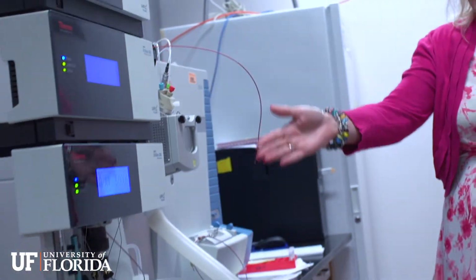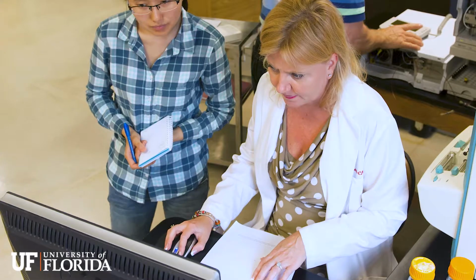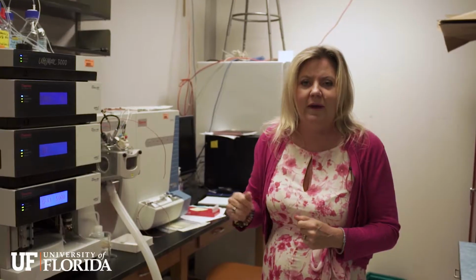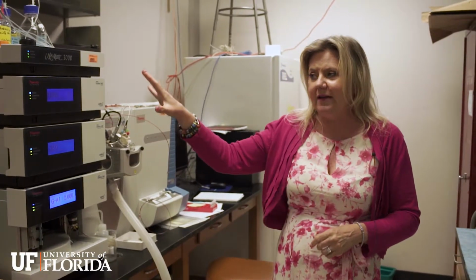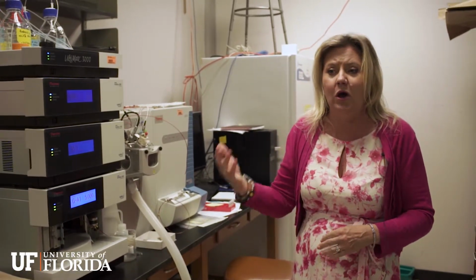This instrument here is an ion trap from Thermo. We predominantly do kind of targeted analysis on this. So for example, we have a researcher that wants to analyze antibiotics in patient samples. And so we can target to just look for these certain antibiotics and do the analysis that way. It also can be used for untargeted. It is a low resolution instrument, unlike the other instruments that are all high resolution. So this one, we're not necessarily dealing with unknowns. We're usually having a target that we're actually looking for that we know.